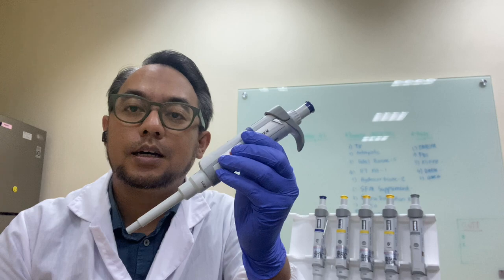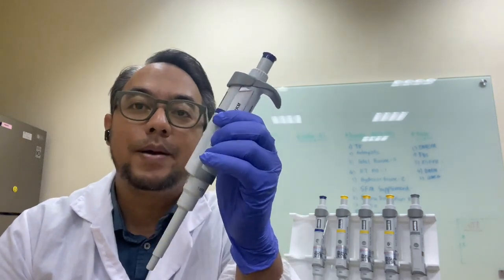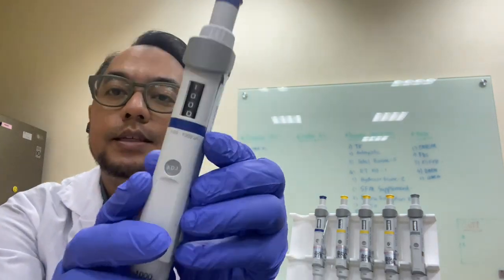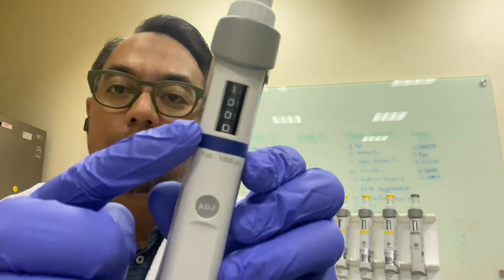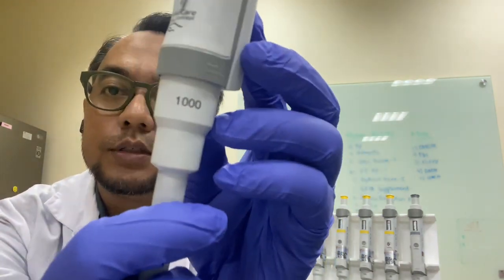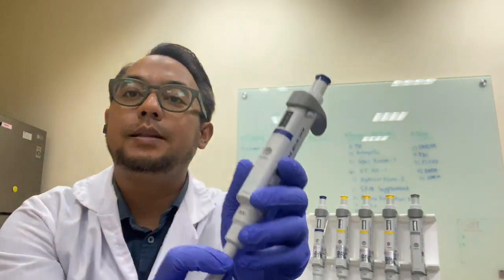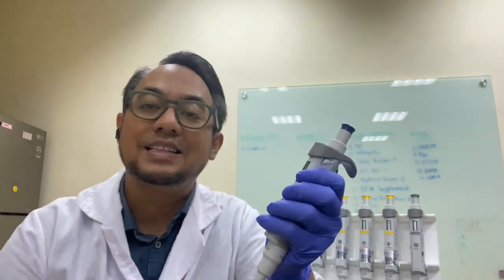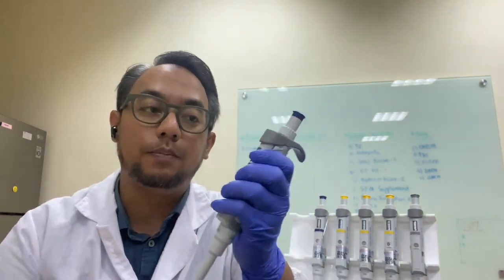So, this is the typical micropipette. Here, you can see there is 1,000 number and you can also see here 1,000. So, it means it has 1,000 volume of the pipette.